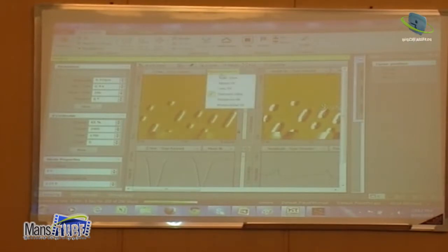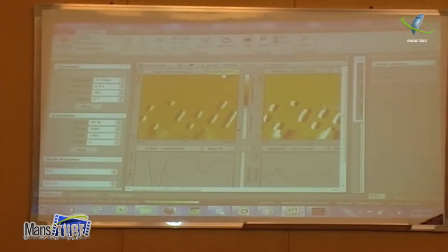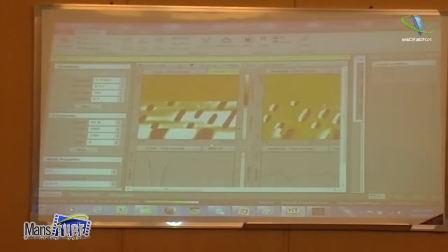And now, capture. And now you can make zoom. Okay. I mean, zoom is here now. This and this, and now we start to see the logo.